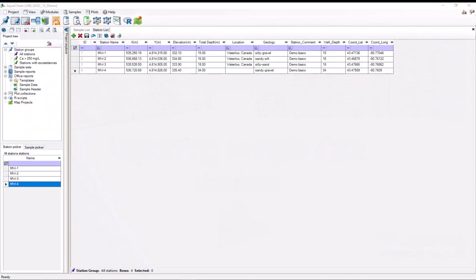Hello and welcome. My name is Nick Lyle, and in this video I'm going to be talking about one of the most basic things that you can do in AquaChem, which is import data.